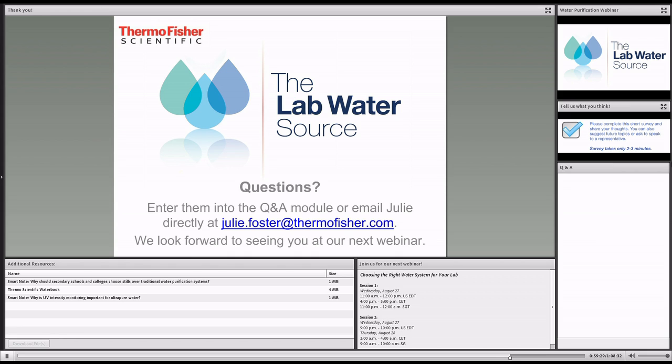Our next question: How long should a lab store double distilled water before using? Back in the day when I was a graduate student, we stored water that we probably should never have stored, and it worked. So my first comment would be, if it's been working, then continue to do it. It's not going to hurt anything.